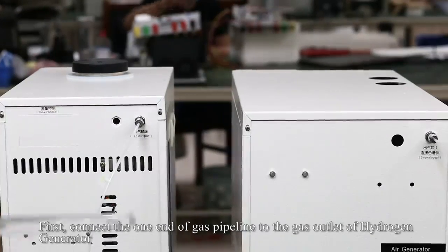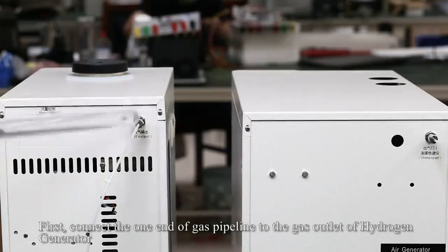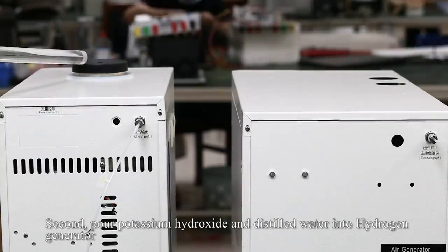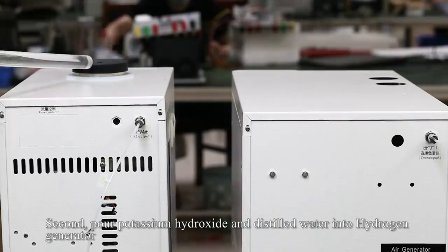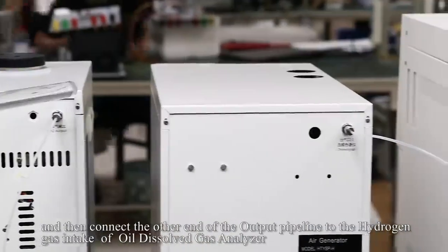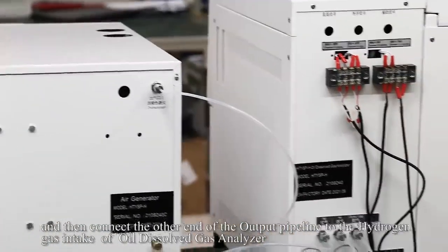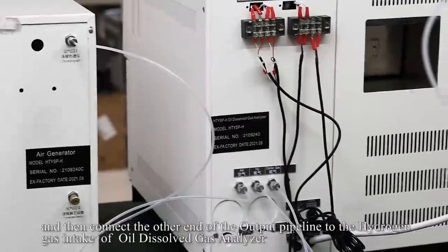First, connect one end of the gas pipeline to the gas outlet of the hydrogen generator. Second, pour potassium hydroxide and distilled water into the hydrogen generator. And then, connect the other end of the output pipeline to the hydrogen gas intake of the oil-dissolved gas analyzer.